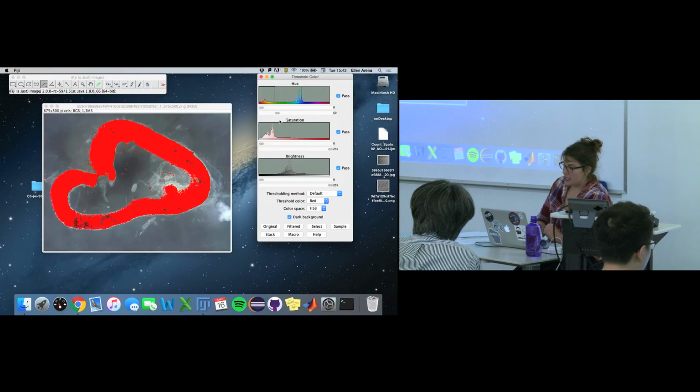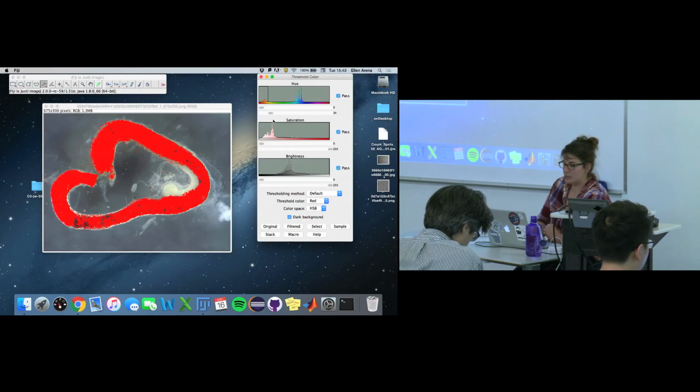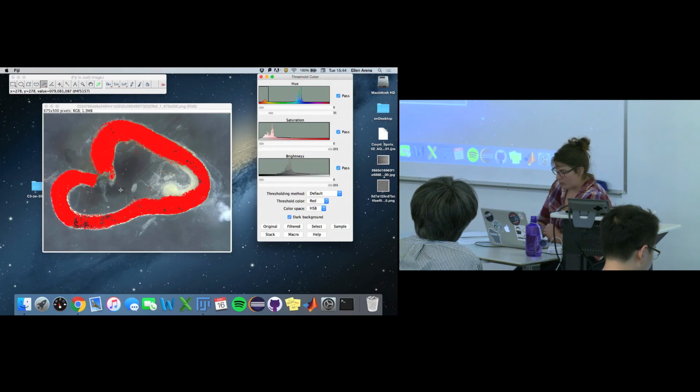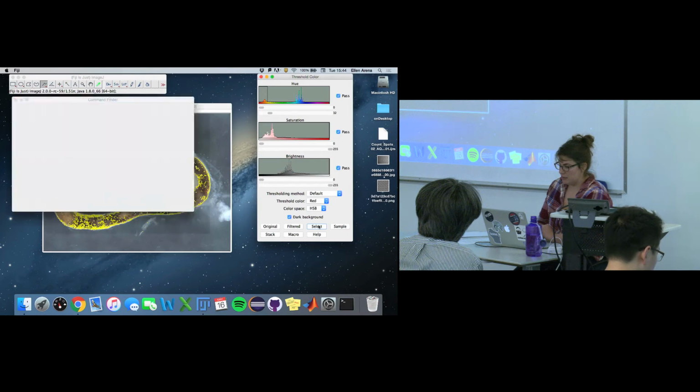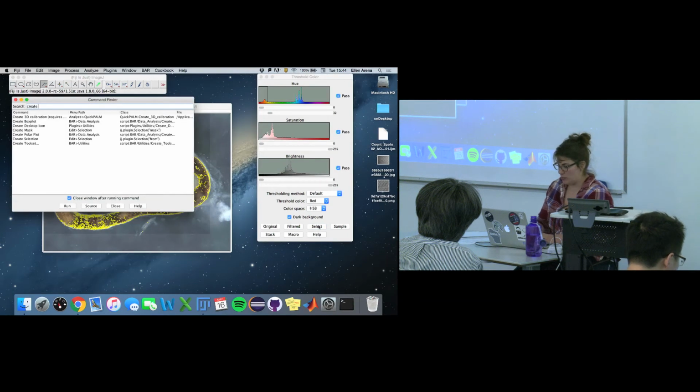So we're just going to try and select the area that covers the length of the tube, actually in this case without connecting the tube here. So you want to make sure these pixels aren't connected at the end. I'd say that's pretty good. And when we're happy with that cutoff, we're going to select that object. And then from that selection, we're going to create a mask. So again, we're going to a binary image, okay, and duplicate it just to be safe.